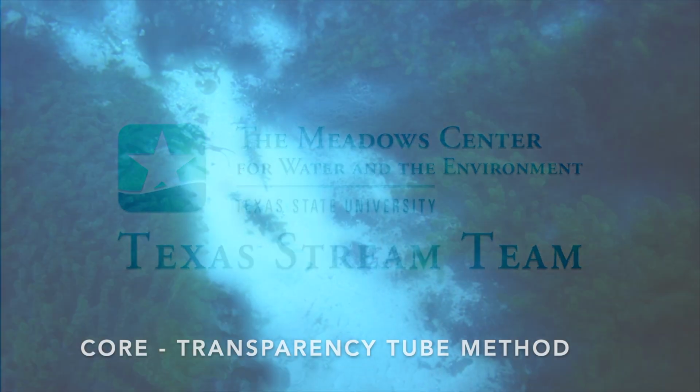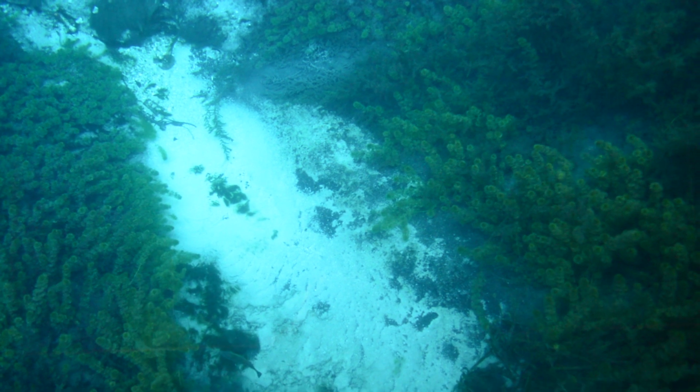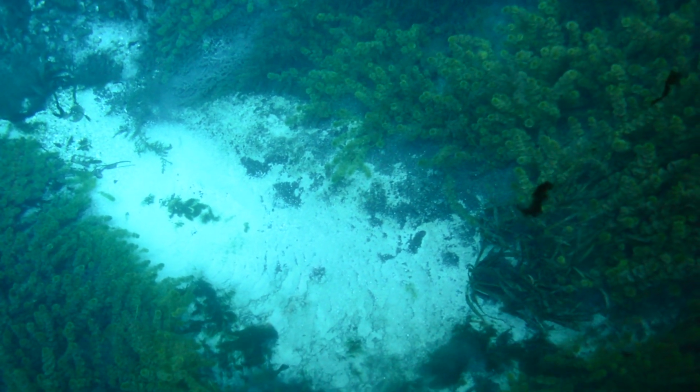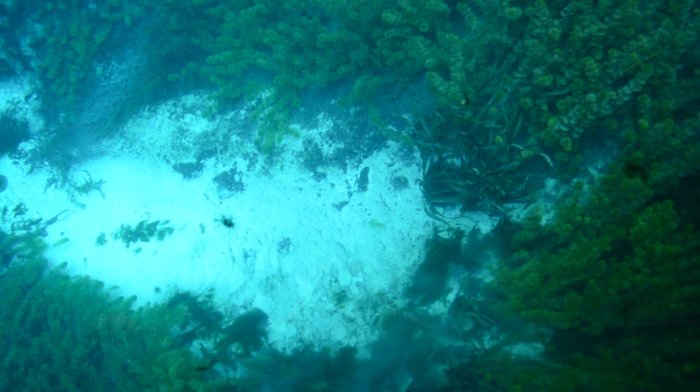Materials that become mixed and suspended in water will reduce its transparency and make the water turbid. Turbidity is a measure of water transparency, specifically of how much the solid matter suspended in water decreases the passage of light through the water column.